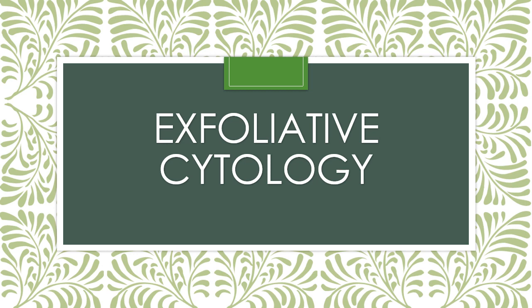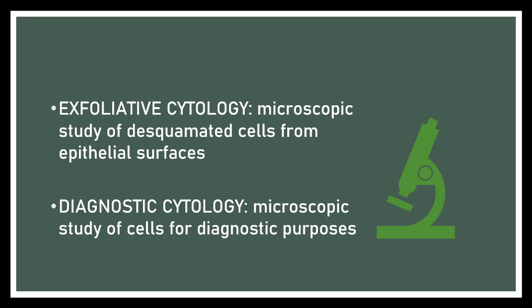Okay, so hello. Today we're going to talk about exfoliative cytology. Exfoliative cytology is part of diagnostic cytology. Diagnostic cytology includes exfoliative cytology and fine needle aspiration. Diagnostic cytology is the microscopic study and microscopic exam of cells from different body sites for diagnostic purposes.